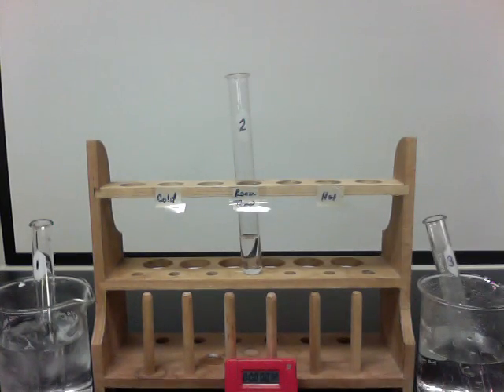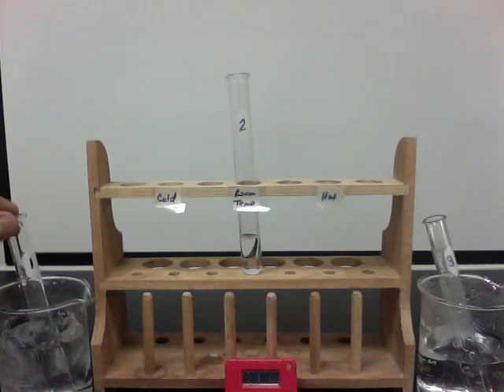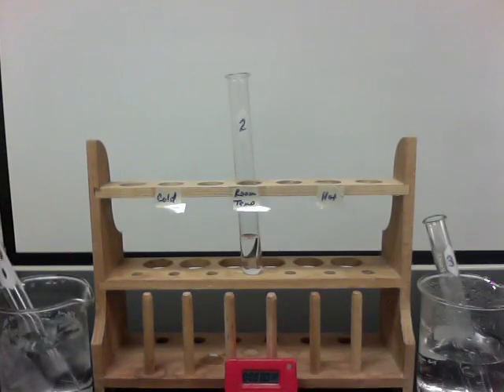In this lab, we're going to be using a percentage of acid that is about 10%. There are going to be 3 test tubes. Test tube 1 is here, and it's sitting in a beaker of ice cold water. It's been in for about 5 minutes, and it has about 5 milliliters of 10% hydrochloric acid in it.